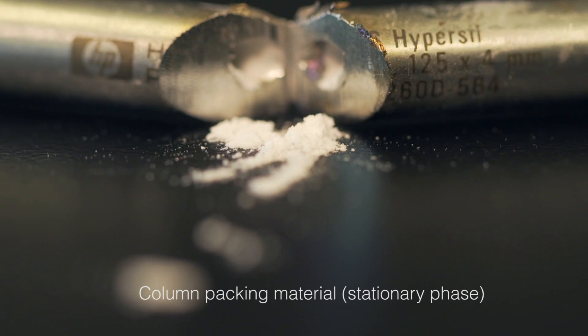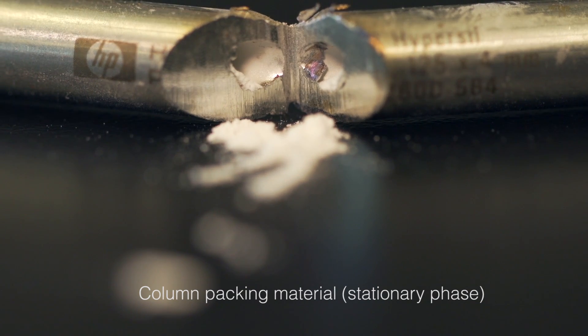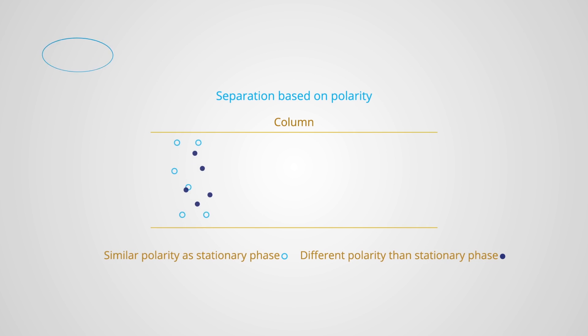The analyte's components separate according to their ability to interact with the stationary phase. Those that interact more with the stationary phase have a longer retention time, whereas the components that interact less with the stationary phase and more with the mobile phase have a shorter retention time.